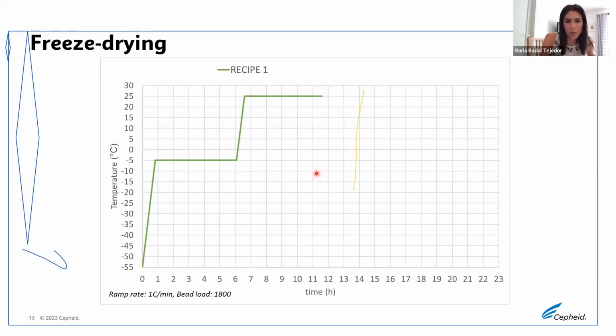First, cycle 1. Cycle 1 has more standard lyo conditions. The energy during primary drying is given not in such a large amount, since we set the shelf temperature to -5 degrees, and secondary drying is performed at 25 degrees.